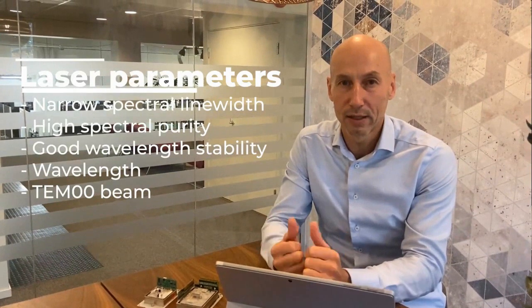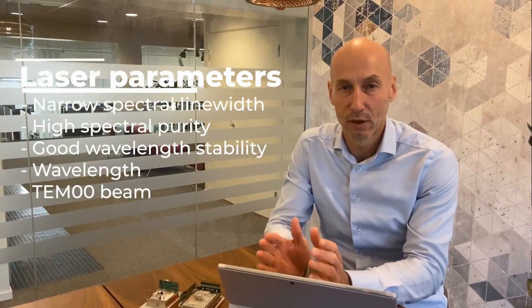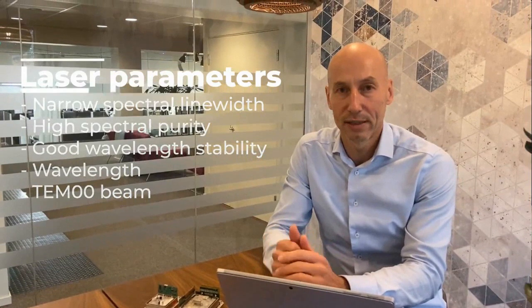We have also seen that there is now a very large range of solid-state based laser alternatives available for Raman spectroscopy, which makes it more and more attractive to start to combine those lasers into pre-aligned laser combiner platforms. And if that is not enough, we have also seen that there is now a possibility to use widely tunable single frequency laser sources perfectly suitable for Raman spectroscopy.